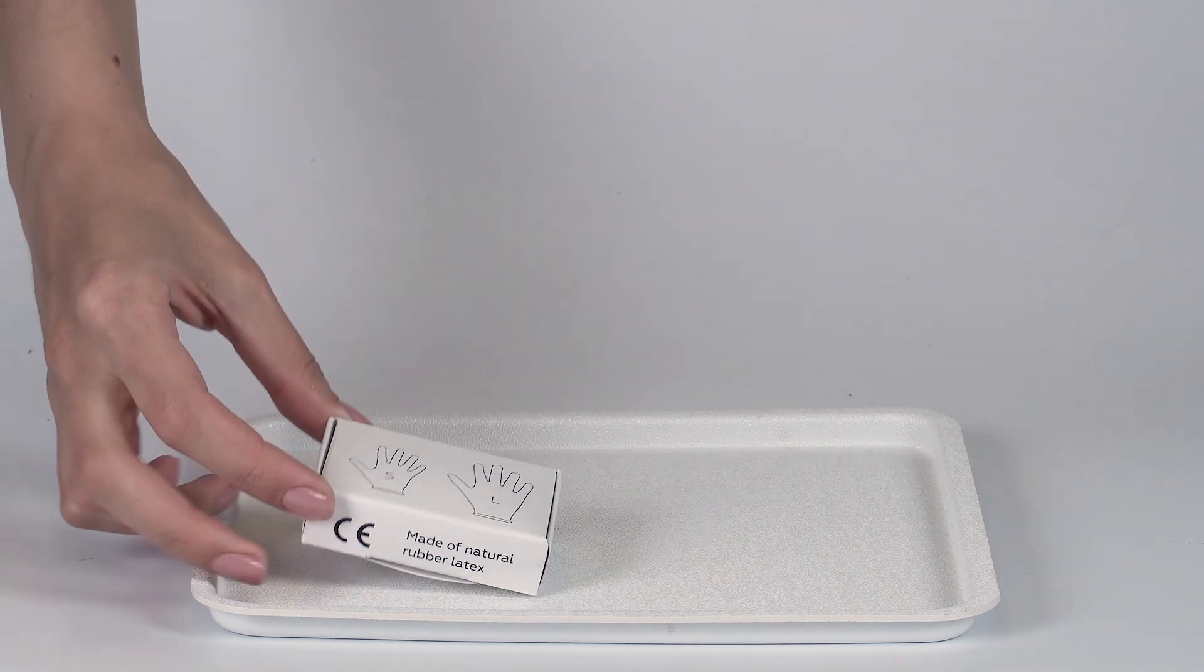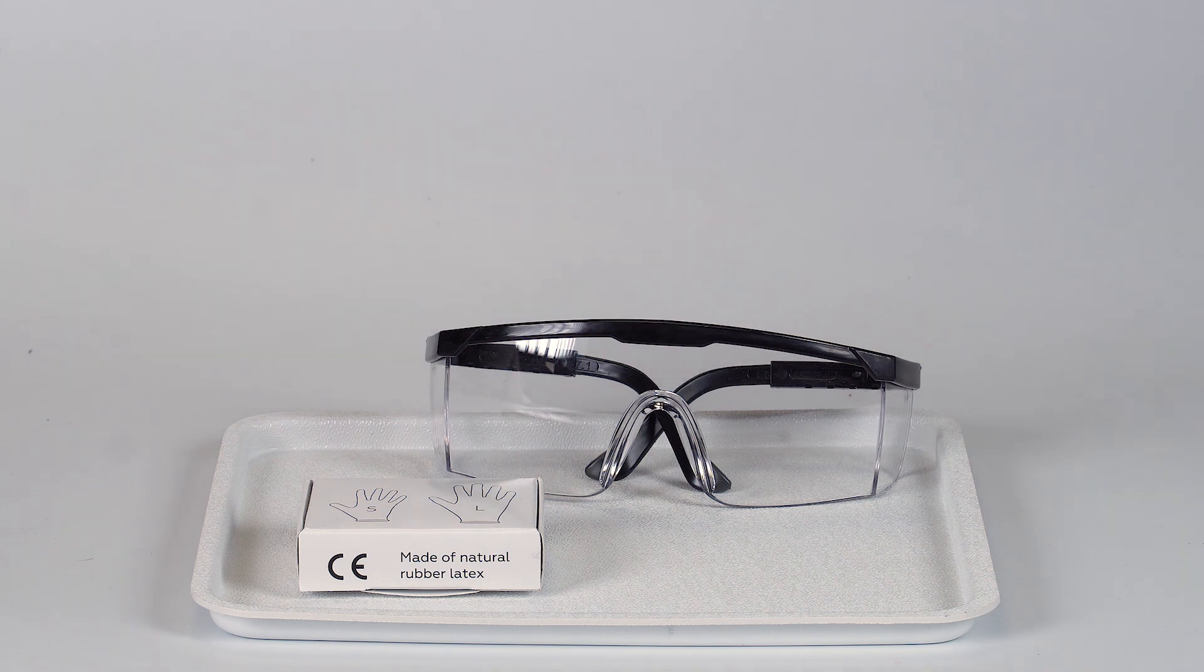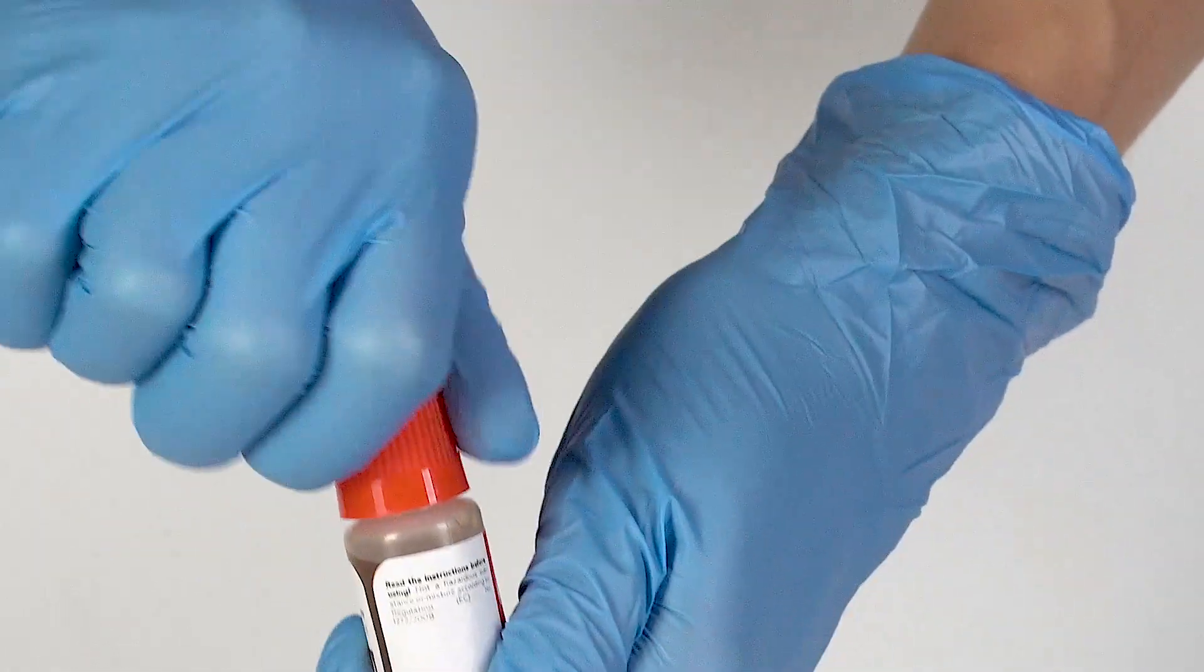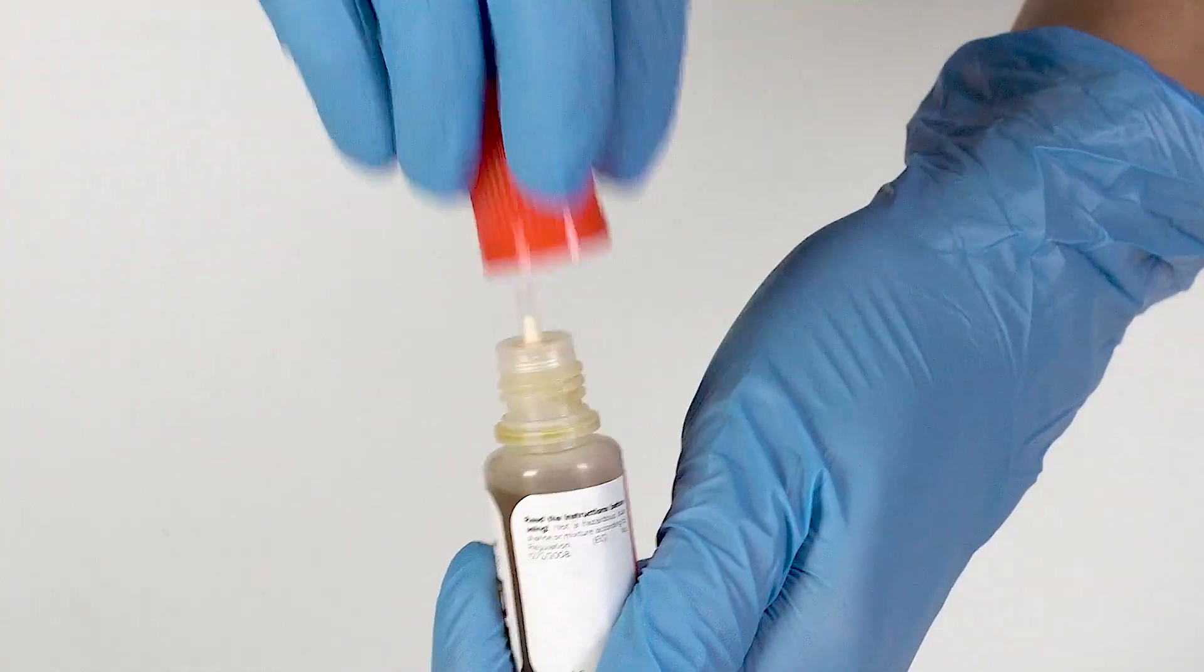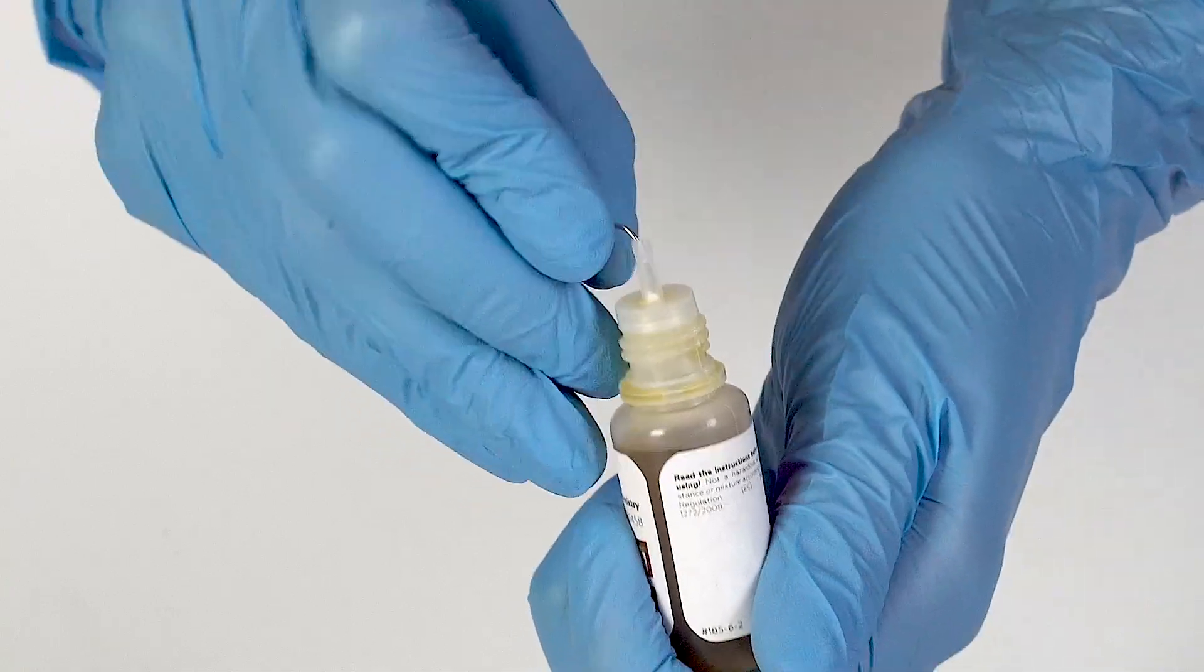Perform this experiment on the plastic tray to contain any spills. Don't forget to put on protective gloves and goggles before doing the experiment. To open a bottle containing a reagent, push the cap down and turn it. Pierce the bottle nozzle with an unbent paperclip.